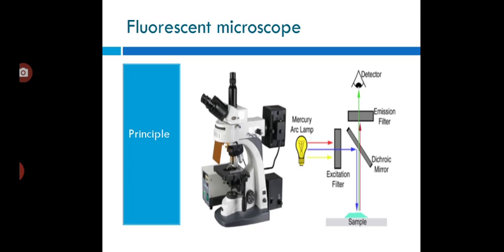This uses a high intensity light source which excites a fluorescence agent, which in turn emits low energy light of a longer wavelength that produces the image. The fluorescent light can be separated from the surrounding radiation using filters designed for that specific wavelength, allowing the viewer to see only that which shows fluorescence.